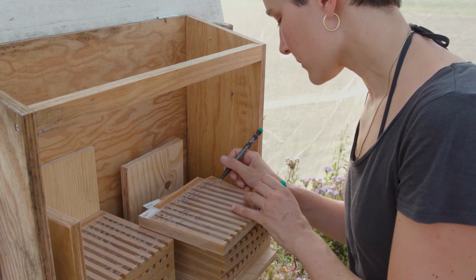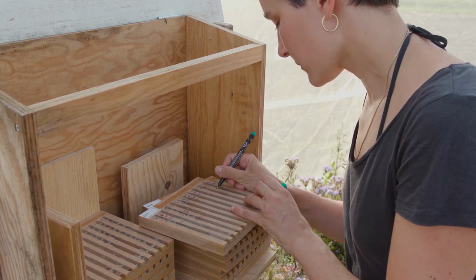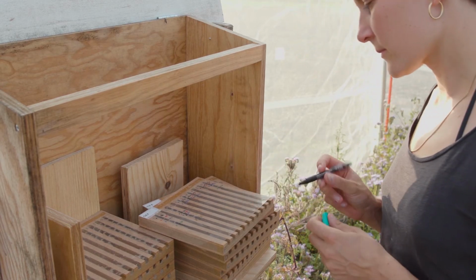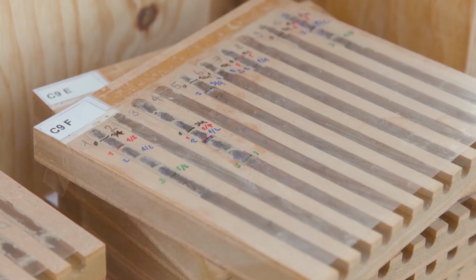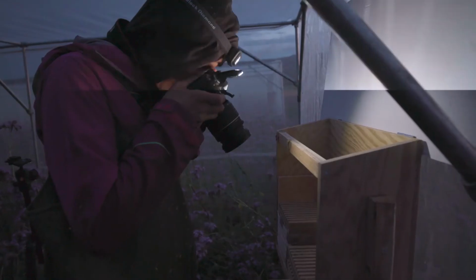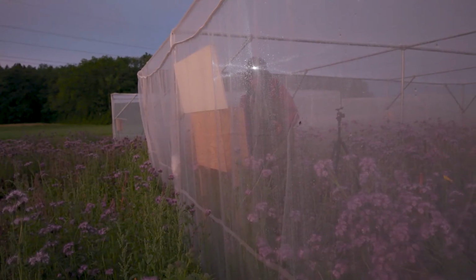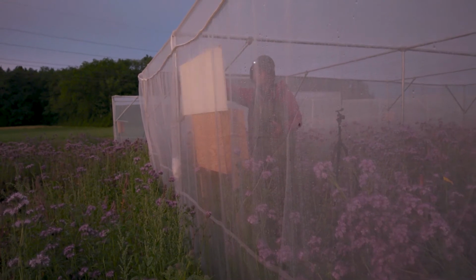We used values of 1/2 for incomplete cells that only contain pollen. A value of 1 represents cells that were completed and include also an egg and a cell wall made of mud. Nesting females are usually roosting inside the nesting unit during the night. We therefore take pictures from all layers after sunset to count the number of roosting females as a proxy for the number of female bees that are still alive on a particular day of the experiment.